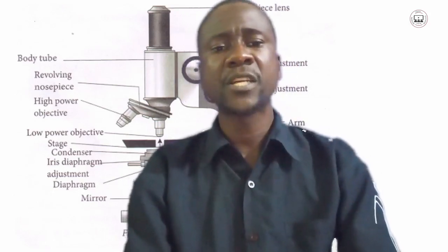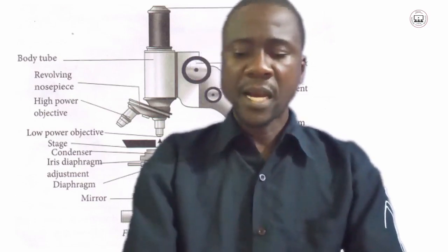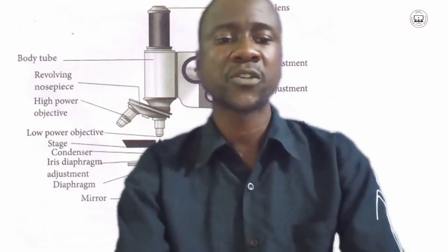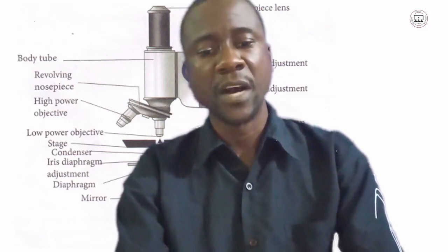Thank you for your observation. I think you have thoroughly checked the parts of this microscope. Now, I want you to see this video, which happens to explain more about the parts of this microscope and some of their functions.